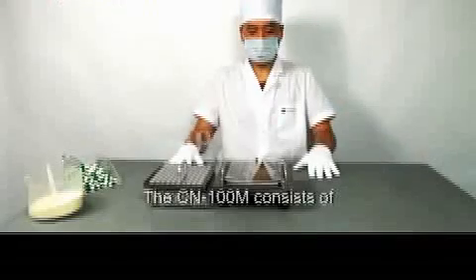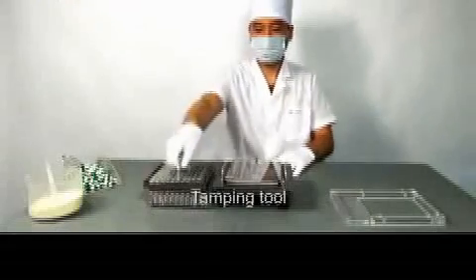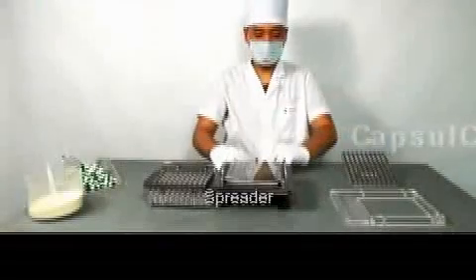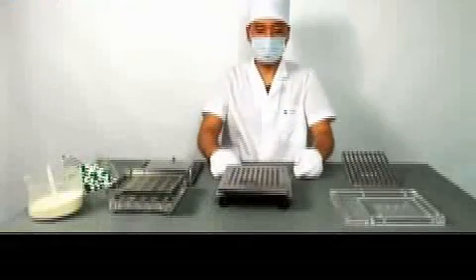N100M consists of one powder guard, one tamping tool, one spreader, one loader, one collector with hinged cover, one body sheet set with three parts A, B and C, and one body base.